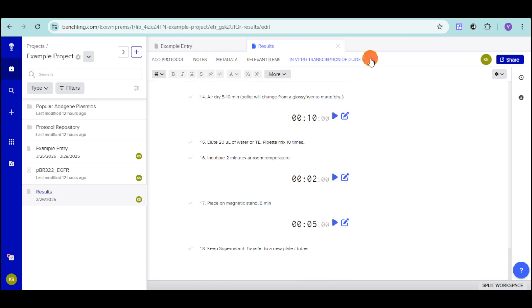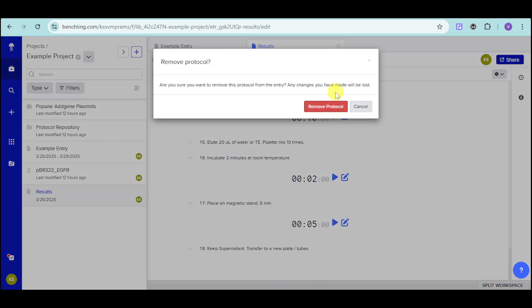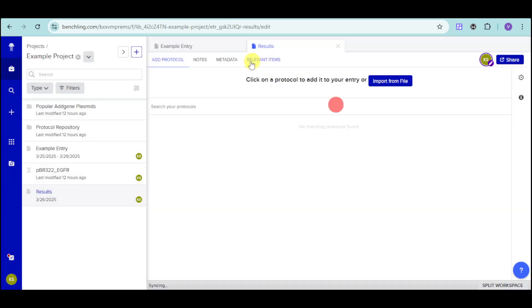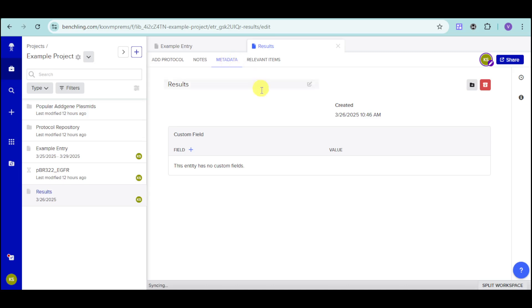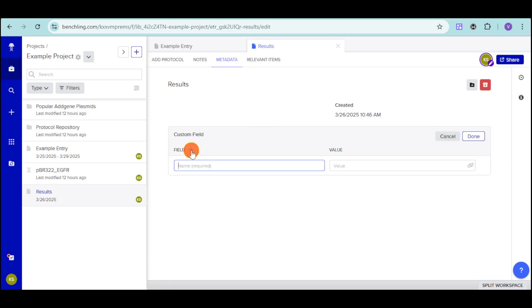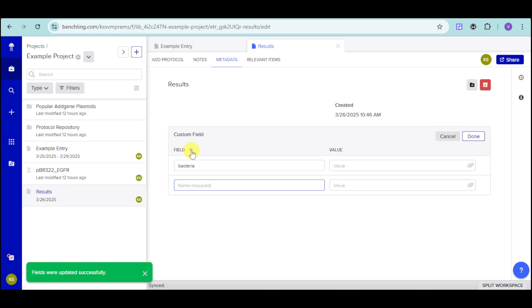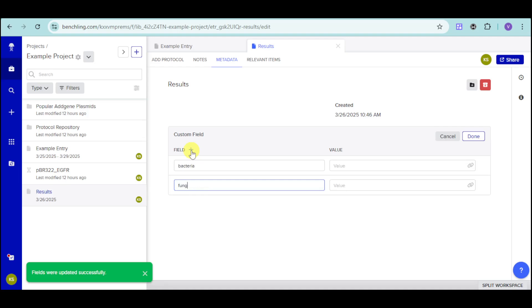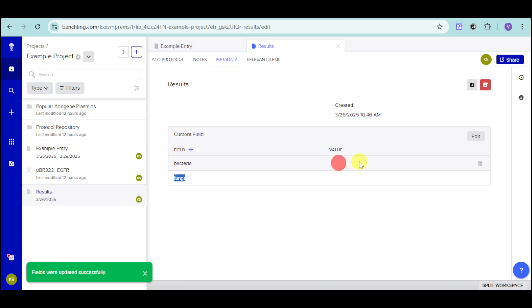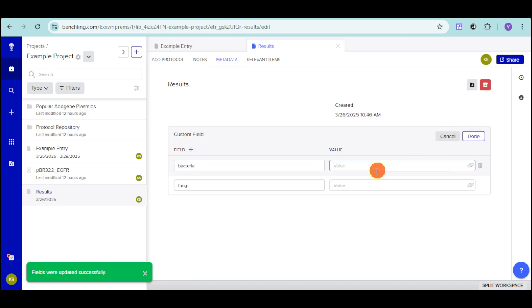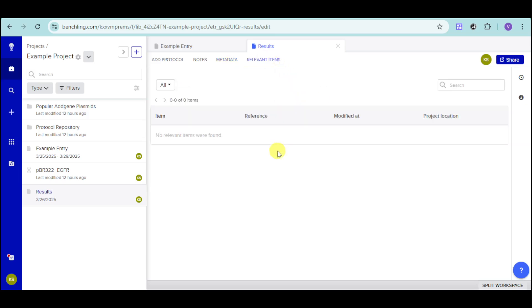In here, we also have the metadata for that particular entry. In here, you can add some fields or some custom fields depending on your liking. You can click onto this plus icon. And then, for example, let's name in here this. Let's add in here bacteria. Let's add another one. Let's call it fungi. And you can add a value based onto that particular option. You can click onto this edit and add in here some value based on that. We also have in here some relevant items. And if you want, you can add those.